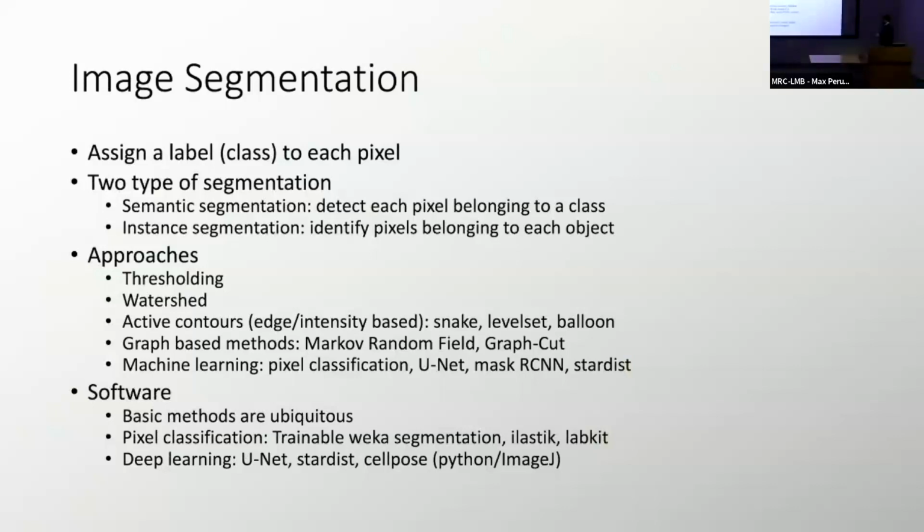So the common approach, the simplest one, is just to threshold. So this will assign class 0 under the threshold, which is not what I want, and above is what I want. This is the simplest way to do it. This thresholding is often the last step of several pre-processing steps. You can enhance your image, remove background, you can do several steps and end up with a decision.